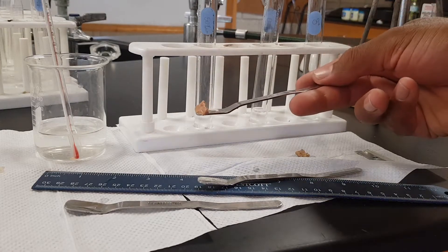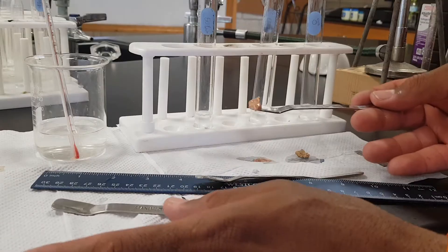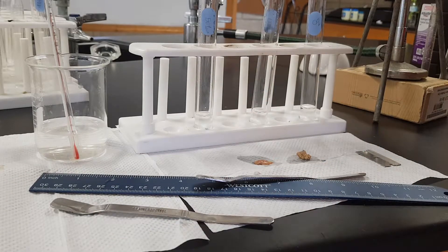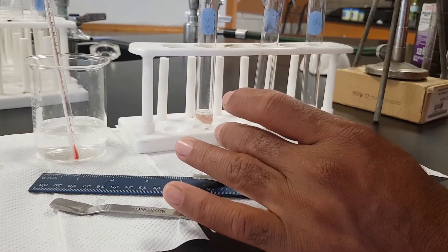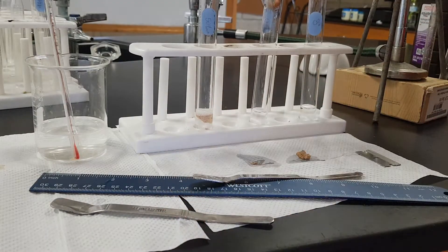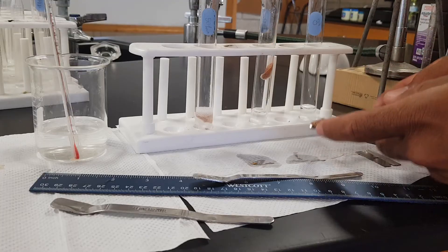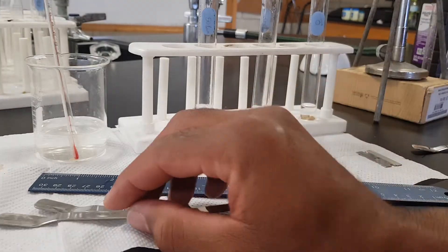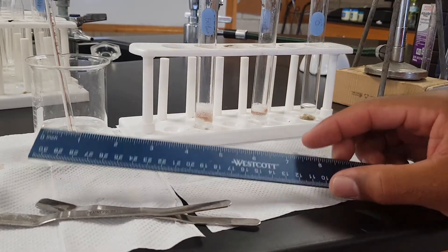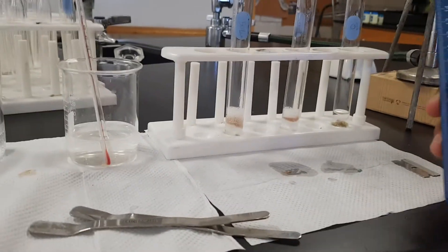Once you have all the liver ready, what you can do next is to put them into each of the test tubes with the hydrogen peroxide. Then you're going to wait for about 30 seconds and measure the height of foam for each.